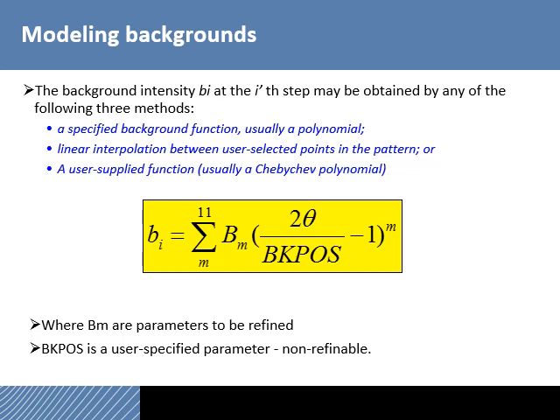When I do my Rietveld refinements, I, for the most part, use a linear interpolation between user selected points in the pattern. At the end of this slideshow, I'm going to reference a video demonstrating a Rietveld refinement, so you'll see what I mean by fitting a manual background.